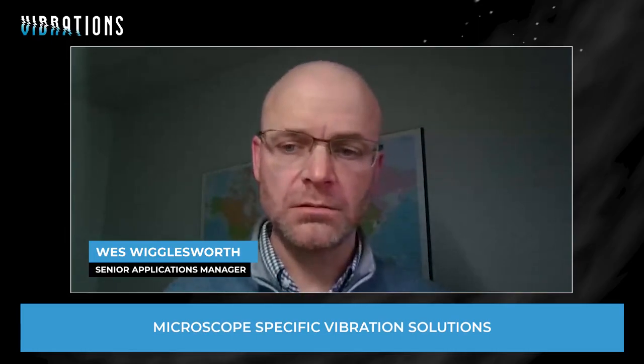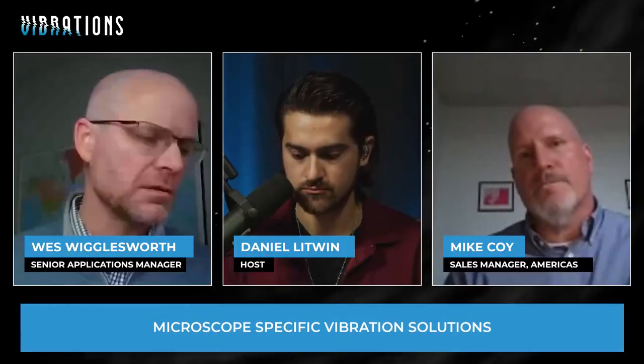And I mentioned pneumatic isolators earlier. A pneumatic isolator for that type of tool just isn't used anymore because of the sophistication of those tools and the automation and the high throughput you can imagine that's demanded in a modern semiconductor fab or factory. So that's a good case of thinking about the automated tools versus, say, a conventional microscope in a conventional lab where you're loading the samples manually.